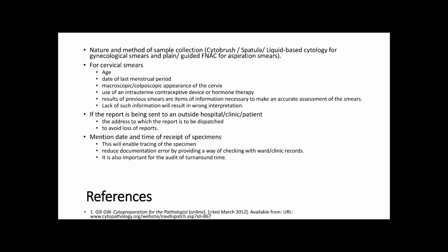So, if the report is being sent to an outside hospital or clinic of the patient, the address to which the report is to be dispatched should be mentioned correctly in the request form to avoid the loss of report.